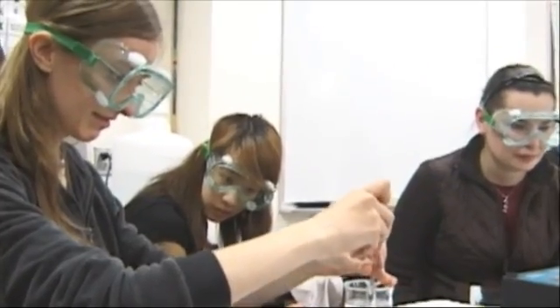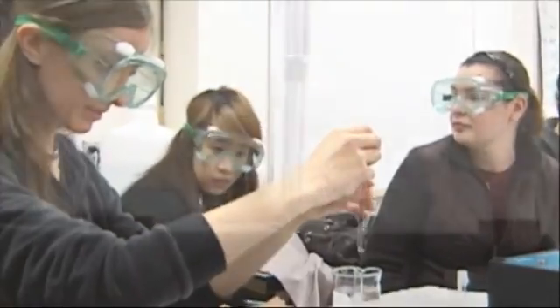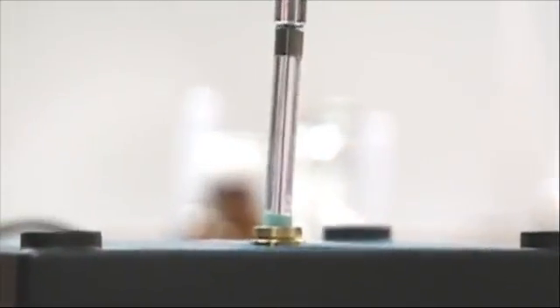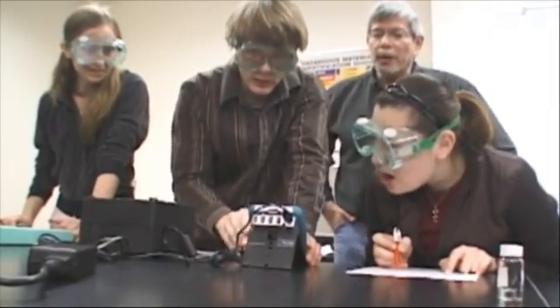Based on patented technology developed by Seacoast Science, the Mini-GC is the size of a small shoebox and uses room air as a carrier gas. What's the best part? It costs thousands of dollars less than a traditional GC.